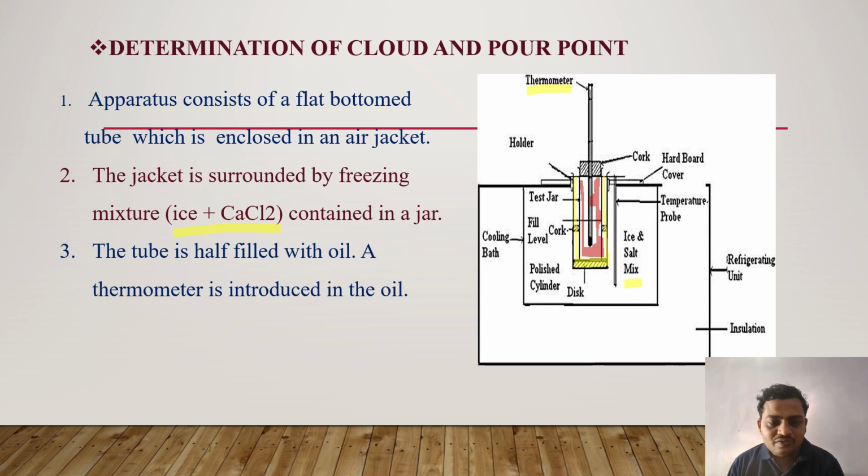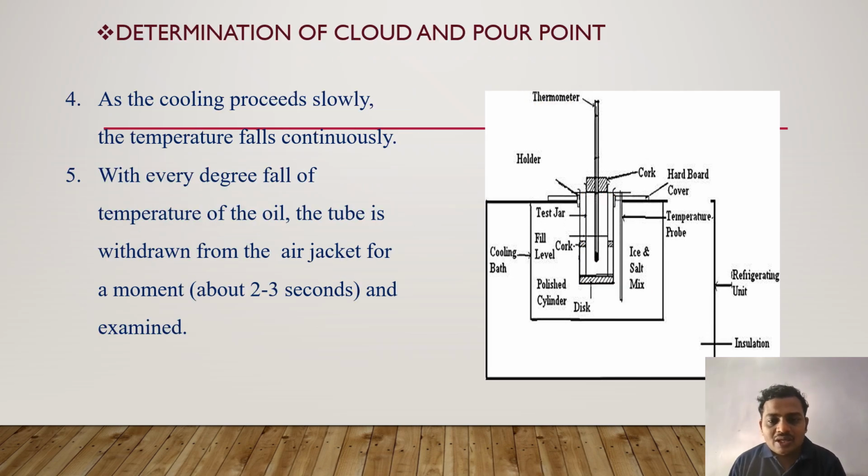First of all, we have to fill oil in the test tube. The thermometer is introduced to measure the temperature of that oil. As cooling takes place, the temperature starts decreasing. We have to record the cloud point of that lubricating oil.